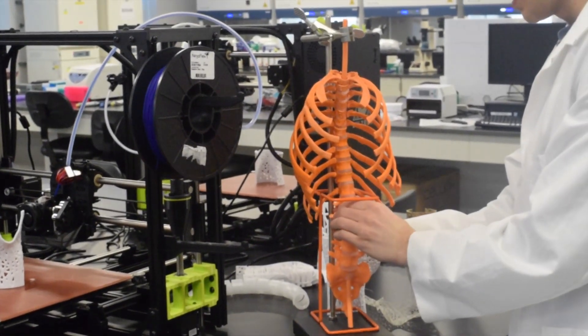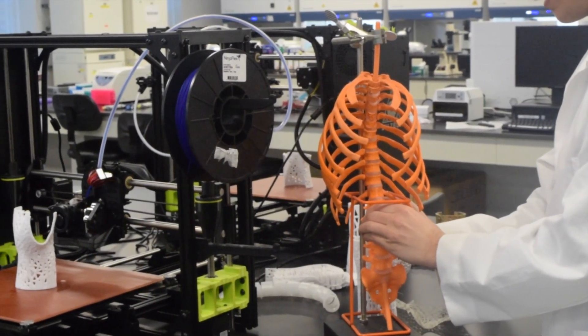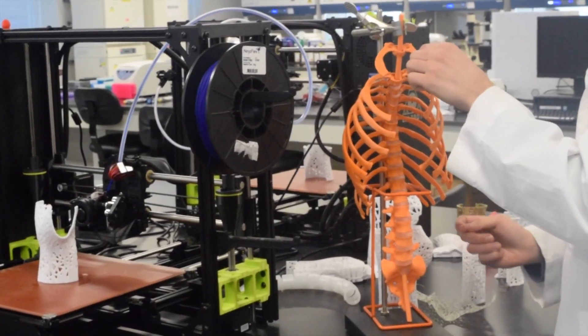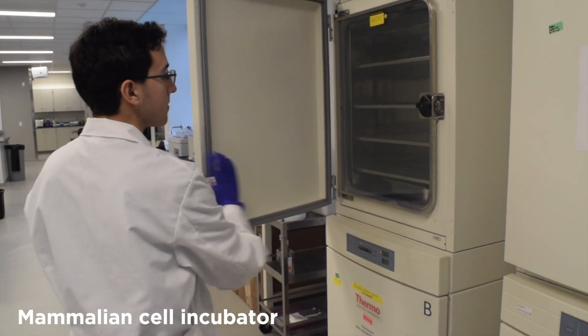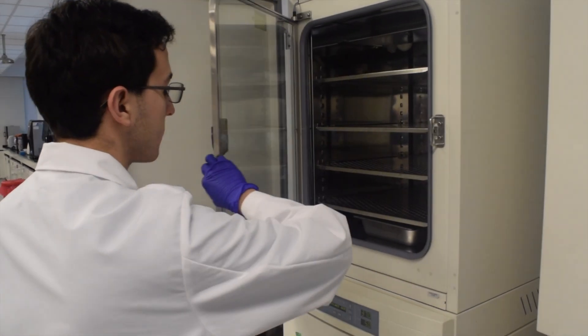This lab space is especially helpful for students who wish to pursue graduate degrees or careers in the biotechnology industry. All of the techniques taught in this lab are state-of-the-art and necessary for anyone looking to pursue a career in cell and tissue engineering.